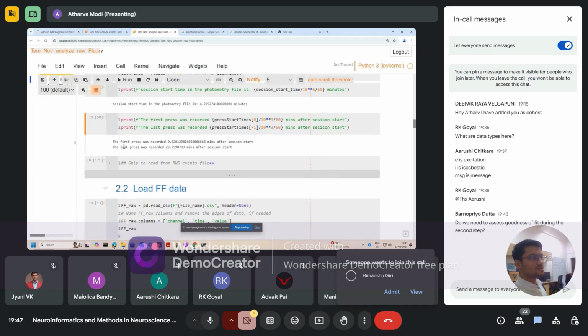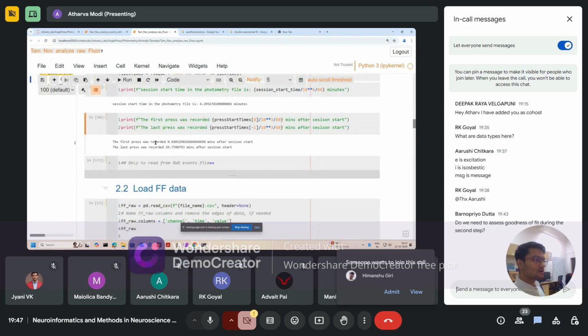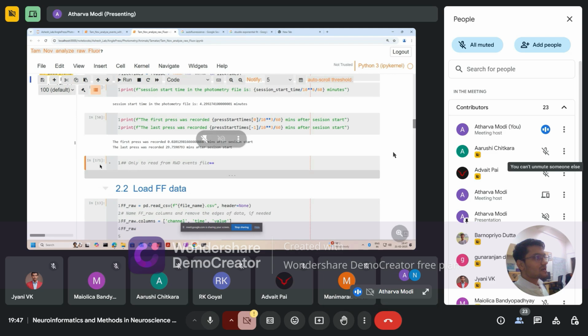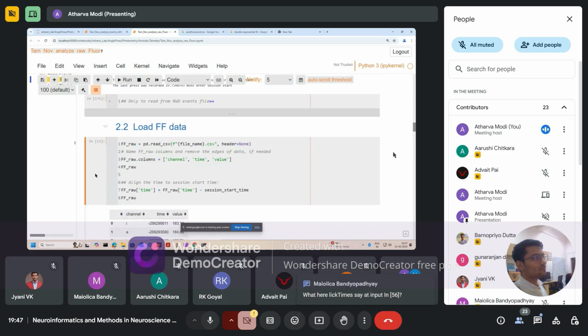This is very specific; you don't need to see this. There can be different data types also. There are different systems which I have used. One of them is manufactured by a company called RWD. It gives out this data in different formats, so you can read that format with some other code, but that's not the main point here.